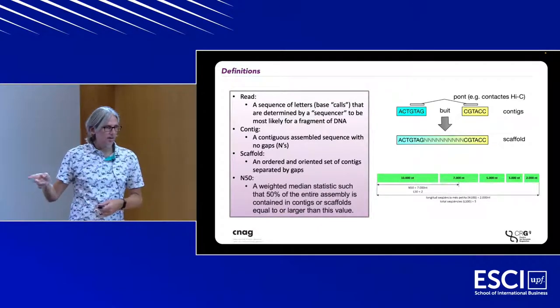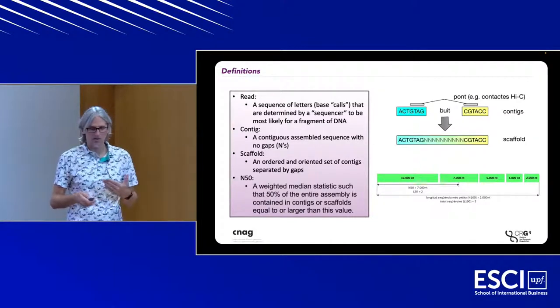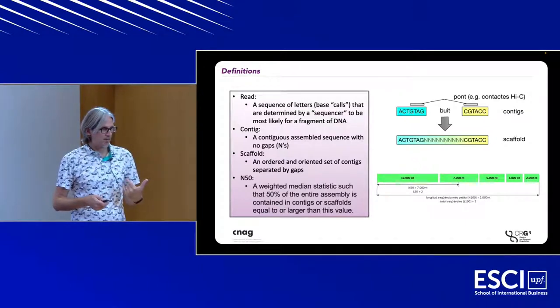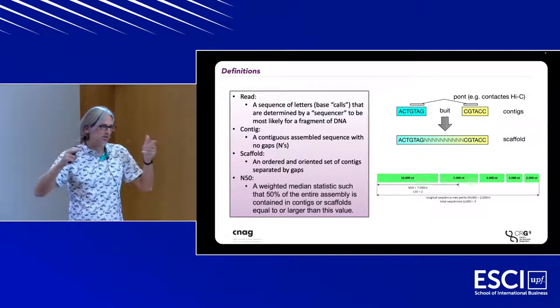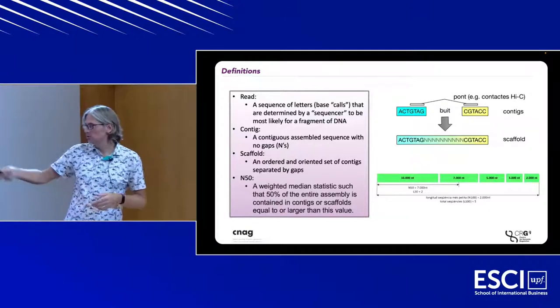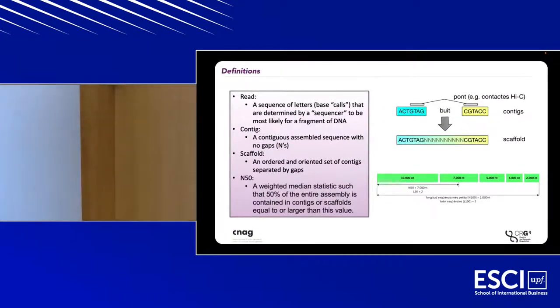And then the last thing that I'll mention several times during the talk is a metric for describing the contiguity of a genome assembly. Okay, it's called the N50. It's not a perfect metric, but it's better than some other ones. Okay, so if you have a set of sequences and you want to know what's the average length of the contigs in this assembly, you could average them, but you might have a bunch of like 10 base sequences at the end or something like this. You know, 100 base sequences, maybe the length of an Illumina read, and they're not really assembled. Generally, we keep the reads out and we keep only contigs, which is at least two reads assembled. But there could be a bunch of small stuff at the end. And if you just took the average, let's say there were 1,000,000 one nucleotide sequences down here, the average would be like one. Okay. All right.